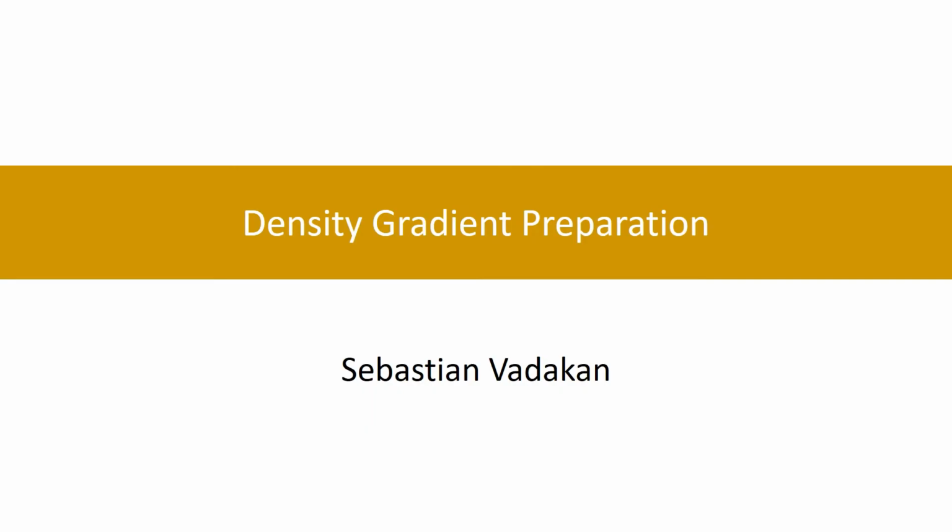We have made remarkable progress in understanding centrifugation. We looked at differential centrifugation, we have looked at density gradient centrifugation, etc. Now let us look at another very important topic in understanding density gradient centrifugation. That topic is how to prepare a gradient for density gradient centrifugation. So this session is going to discuss all about that.